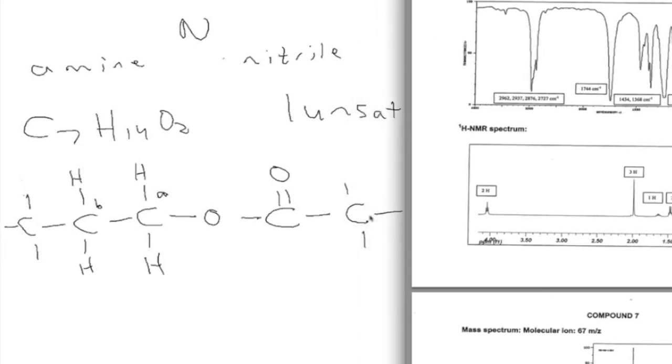Maybe it would be good to work away in this direction. So which peak do you think refers to this carbon? That's it. Wait, which carbon? Or that one there. Which peak do you think refers to this carbon? Oh, the one at 2? Yeah, the 3H. How do you know?